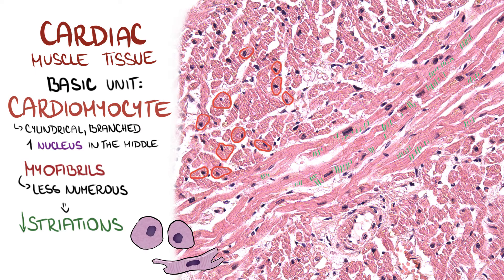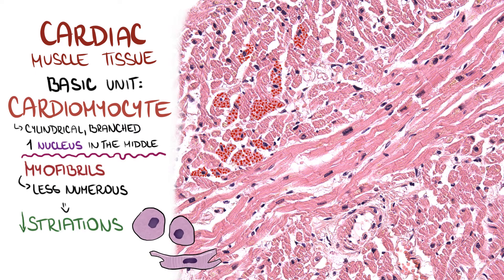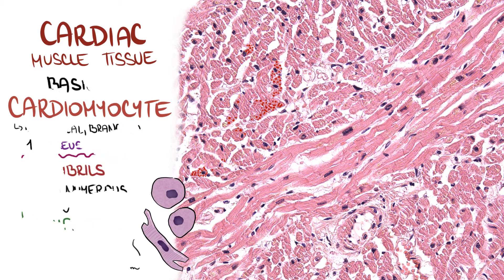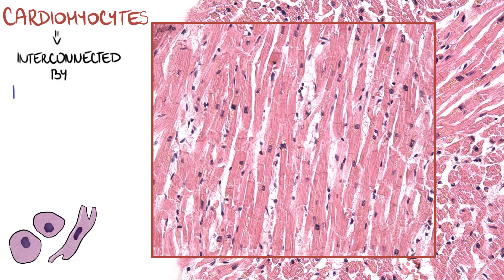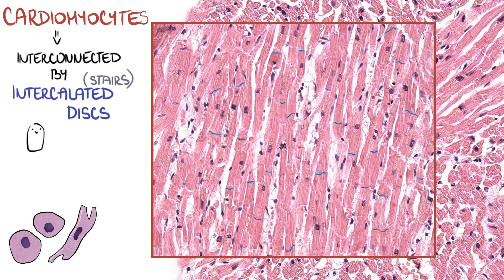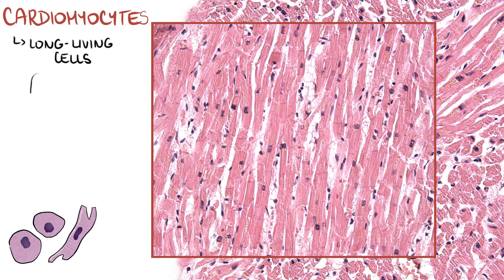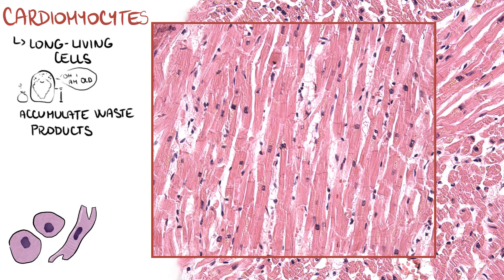The cross section of a cardiomyocyte is similar to that of skeletal muscle. We can appreciate small eosinophilic dots which are myofibrils, but the difference is that nuclei are in the center. Length of cardiomyocytes is around 100 micrometers. Individual cardiomyocytes are interconnected by intercalated discs. They resemble stairs and are responsible for cellular communication and synchronization of muscle contraction. Cardiomyocytes are long-living cells, which is why they accumulate waste products in their tertiary lysosomes within their cytoplasm around the nucleus. This structure can be seen as a brown pigment called lipofuscin.